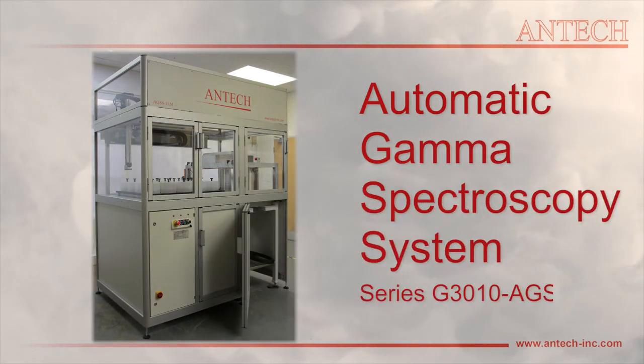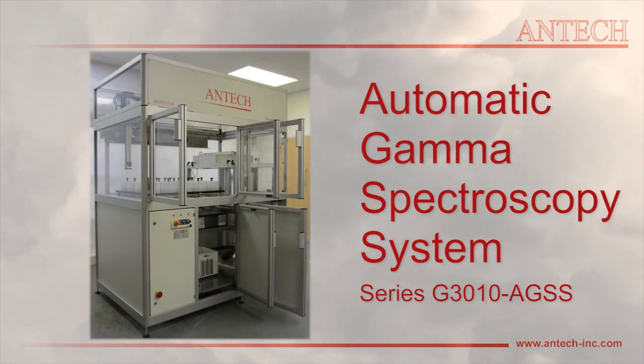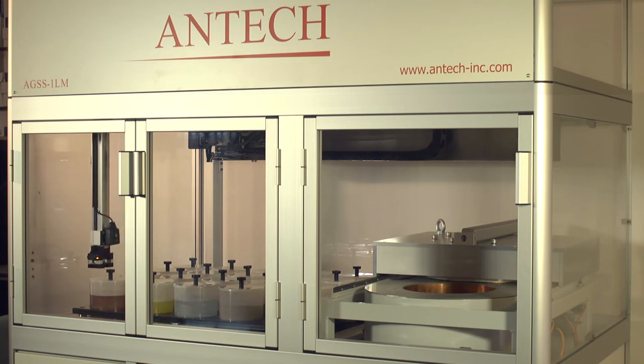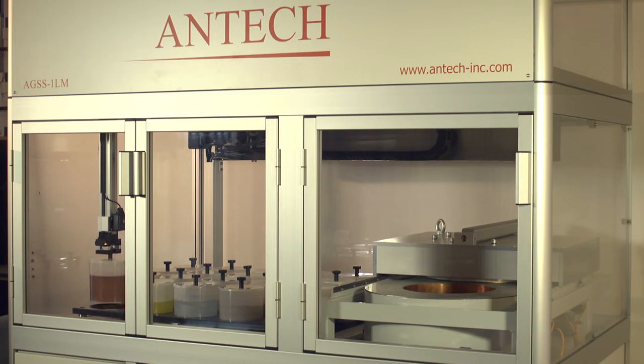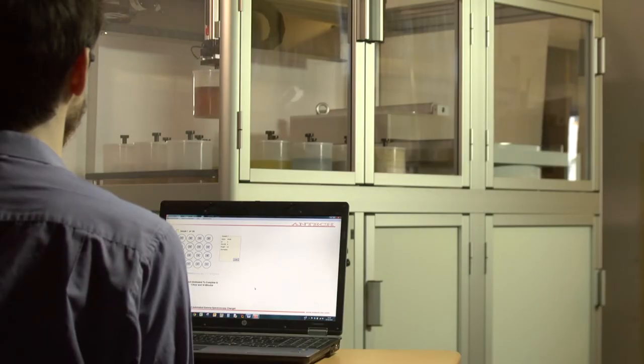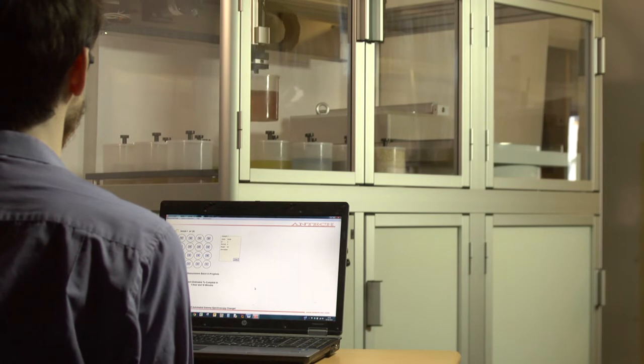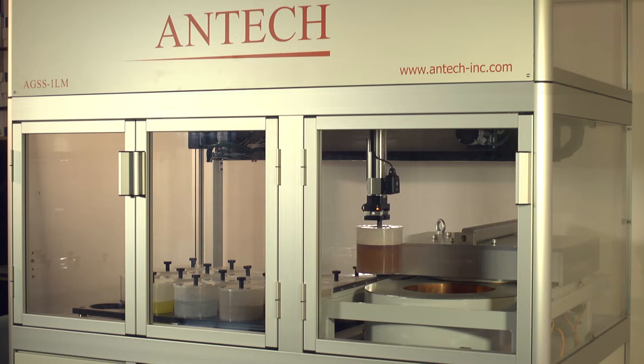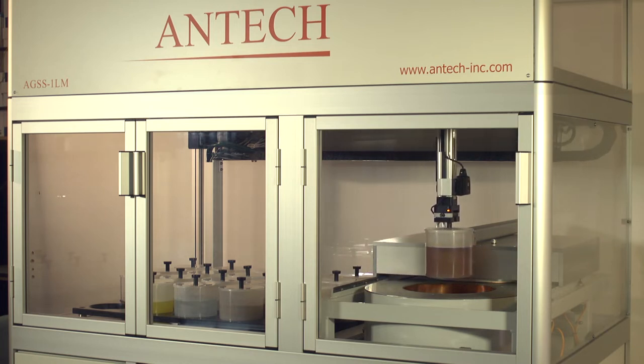The ANTEC model G3010 Automated Gamma Spectroscopy System, or AGSS, is an automated system for gamma-ray spectroscopy measurements of samples in Marinelli beakers. The system can be employed by counting laboratories and sample analysis and testing facilities to automate the gamma-ray spectroscopy data collection and analysis process of a wide variety of samples, ranging from environmental samples to processed materials such as food. The AGSS can be employed to detect radioactive contamination in materials and also to measure naturally occurring radioactive materials.